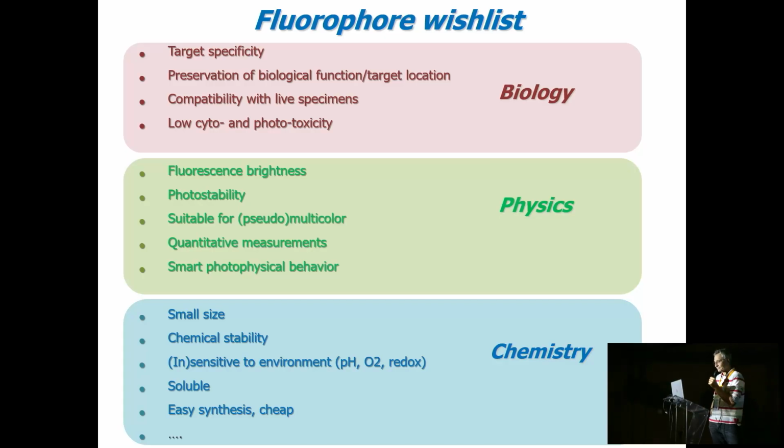for example. Of course, if you like to work with live specimens, you want your fluorophore to be compatible with this. And with this, I mean essentially being able to enter passively into your cells or specimens. And very importantly, you want to minimize cytotoxic effects and phototoxic effects, which are induced by light.